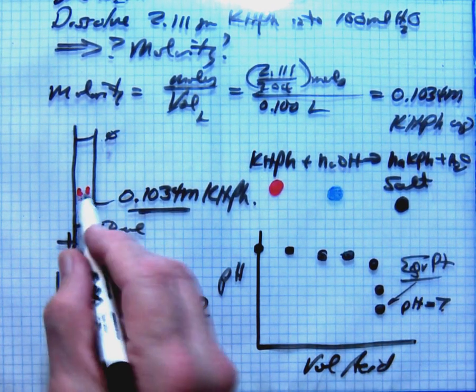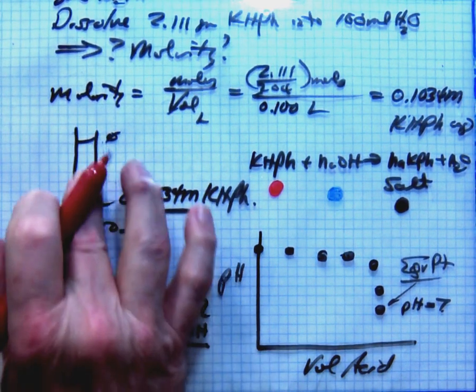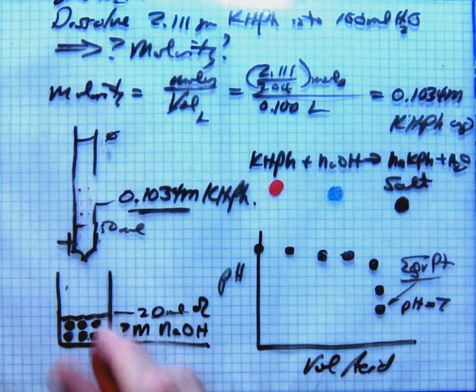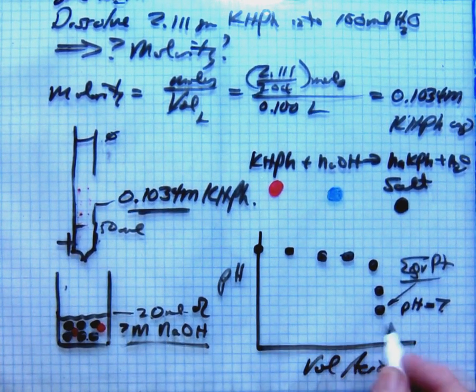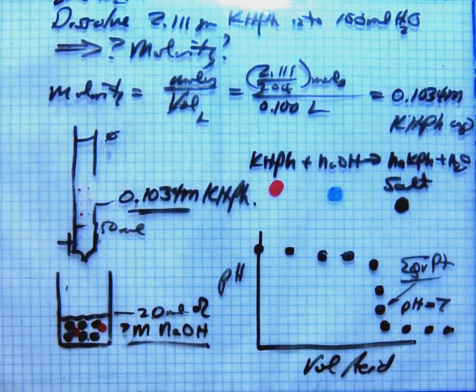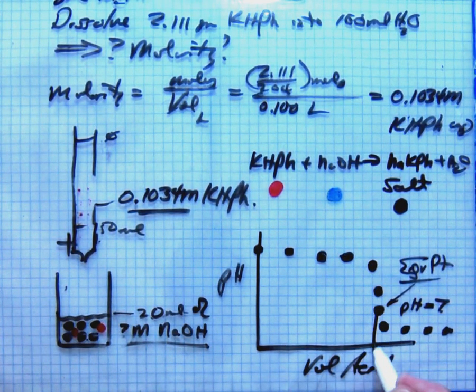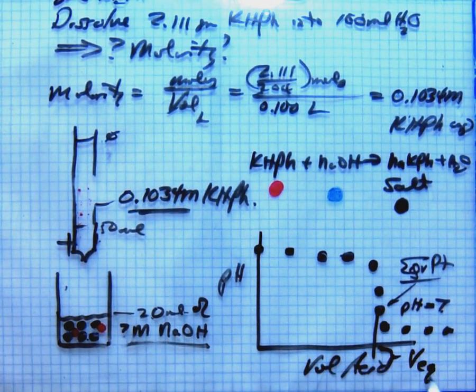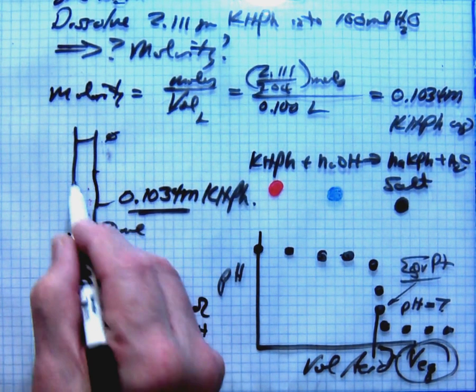Okay? And then if you added these other two in here, it would just be excess acid in here, there, and say right there, and it would just go on out like that, and you would have a titration curve that would look like that. All right? And when you find the equivalence point, come down here, and this is the VEQ. It's called the equivalence volume. All right, now what's so good about the equivalence volume? That equivalence volume is the volume of acid you added.